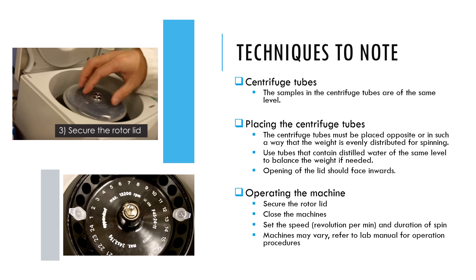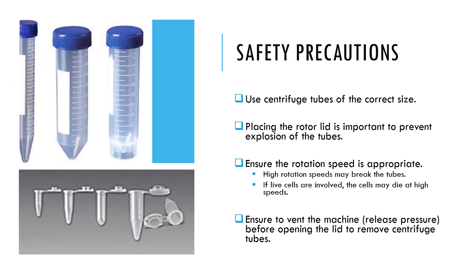The following are some safety precautions when using a centrifuge: use centrifuge tubes of the correct size. It is important to secure the rotor lid to prevent explosion of the centrifuge tubes. The rotation speed selected must not be too fast, as high rotation speeds may break the tubes. If live cells are involved, the cells may also die at high spinning speeds. Lastly, ensure to vent the machine by releasing the pressure before opening the lid to remove your centrifuge tubes.